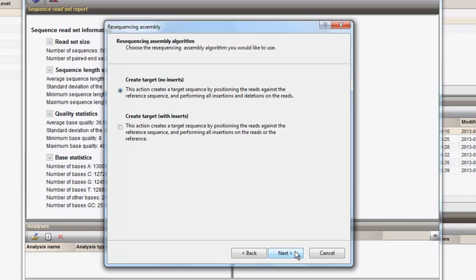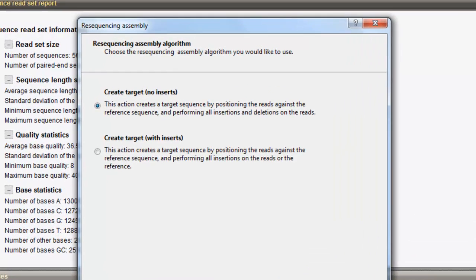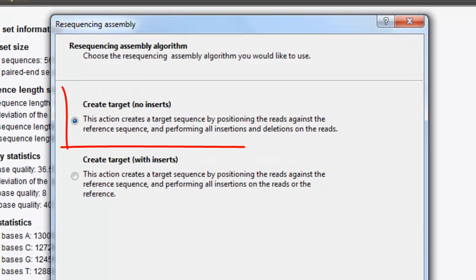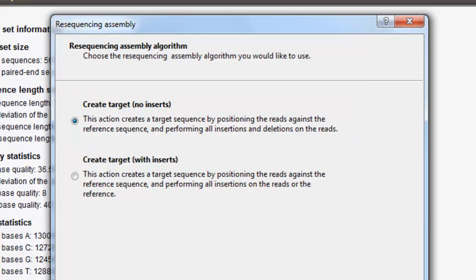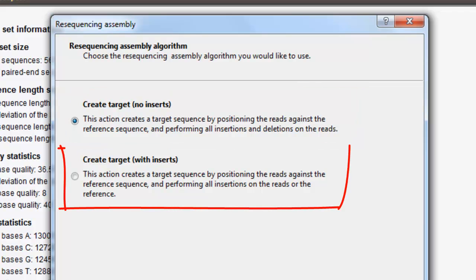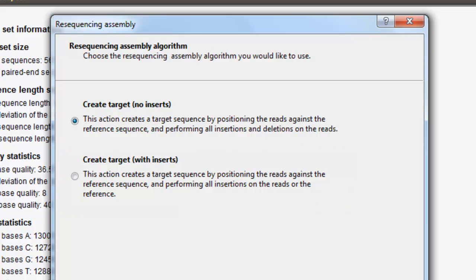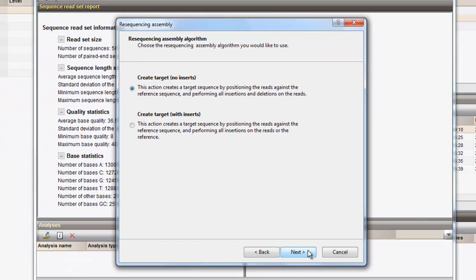Two types of resequencing algorithms can be used. The first option creates a target sequence without inserts, resulting in a target sequence which follows the same frame as the reference sequence. The second option allows to perform inserts on both the reads and the reference sequence. In this specific example, we will maintain the frame of the reference sequence and choose the first option to create a target without inserts.